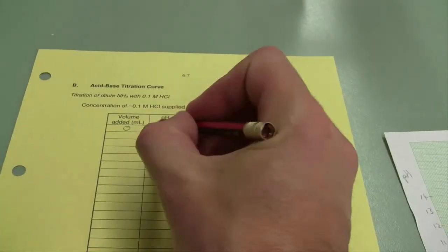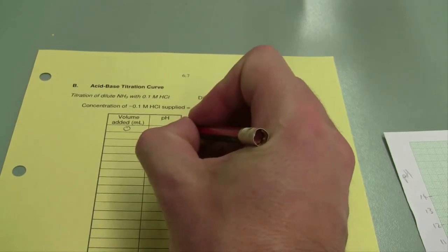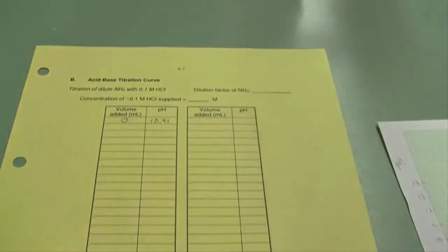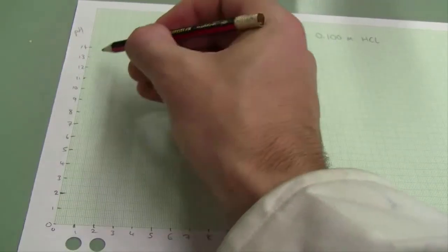Then take an initial reading, volume zero, record the pH of your solution, and plot that on a graph. You need to plot this graph as you go throughout the experiment.